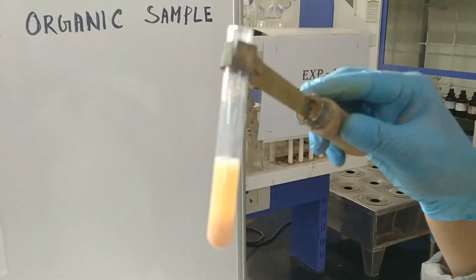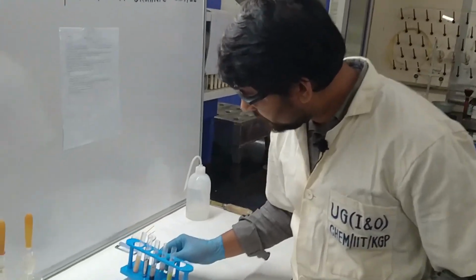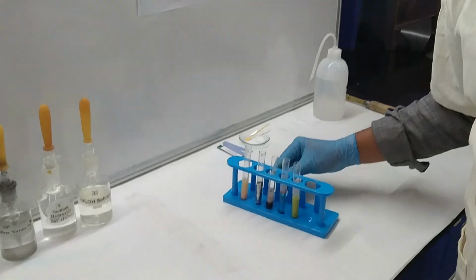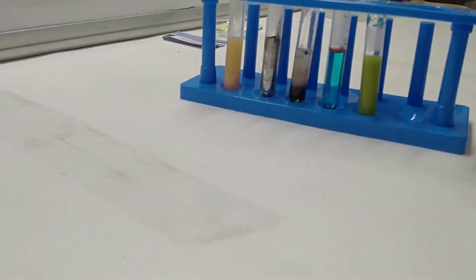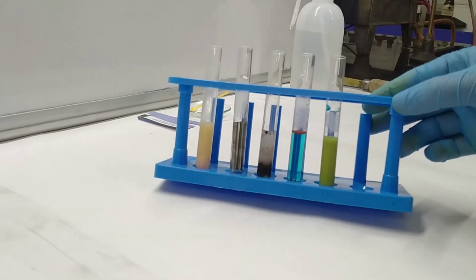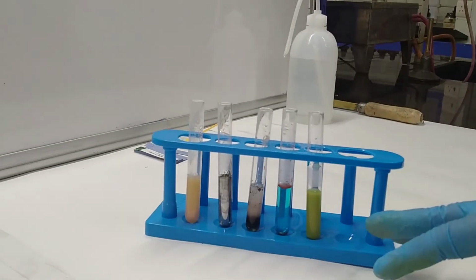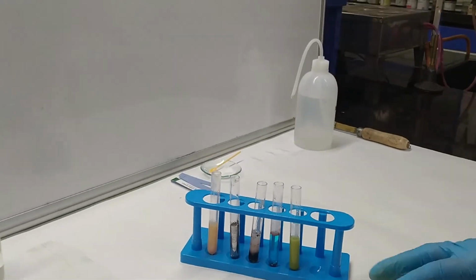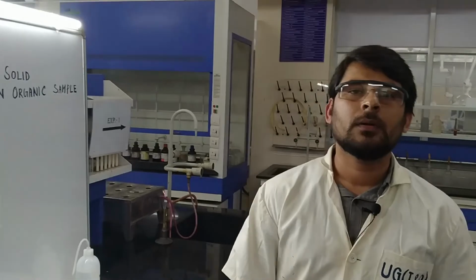Okay. So you can see the 5 confirmatory tests over here. After doing all the 5 confirmatory tests, we get all positive observations, and from this we can conclude our sample is glucose. Okay. Thank you guys.